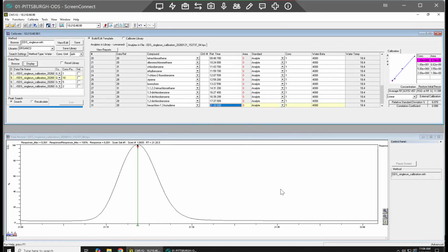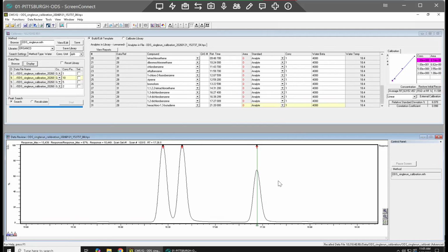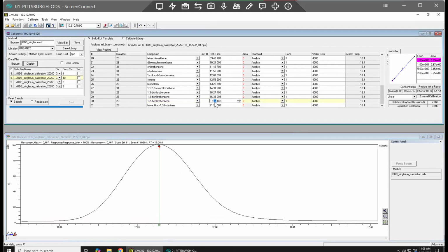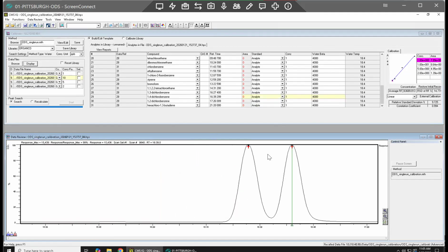So anyway, I'm going to go through a few of these and then I might pause so you don't have to watch me do every single one. But then I would go to the next section here, make sure we're at the apex again. That's pretty close, but yeah, so 1726, 1727. I mean, you can leave it if you want, but we'll just adjust this one. Enter. Oh yeah, enter does work. Okay. Go back again. This one, 1639. That one's good.